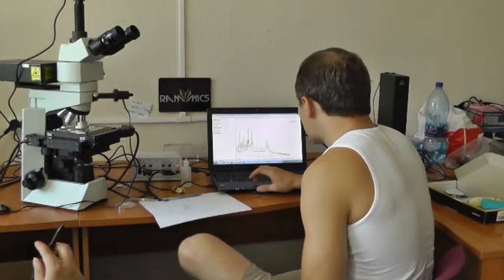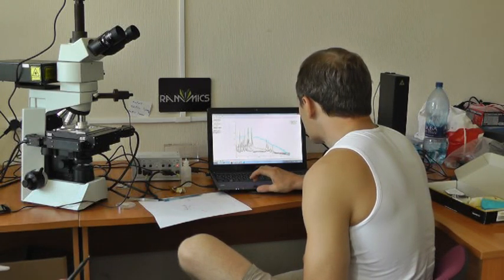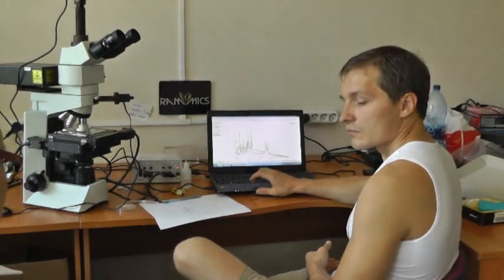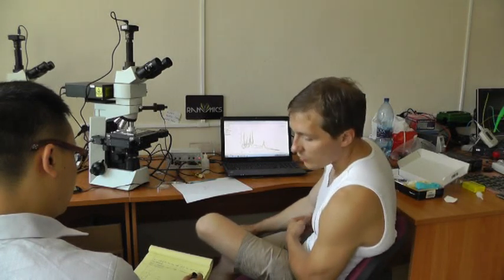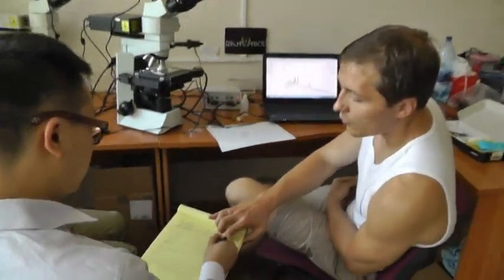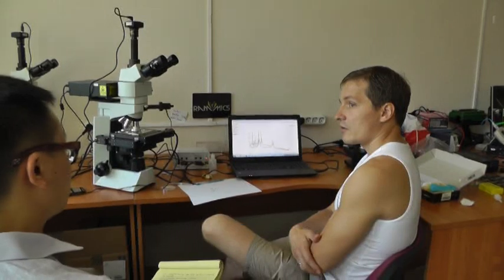I think on Maxim's slide, the PPT, he mentioned it as 0.5 in 20 minutes and 0.1 in 100 minutes. That is close to, yeah, about like this. I told you I got 0.3% for 30. But it depends on the sort of substances. Yeah, of course. And the exposure time you choose.